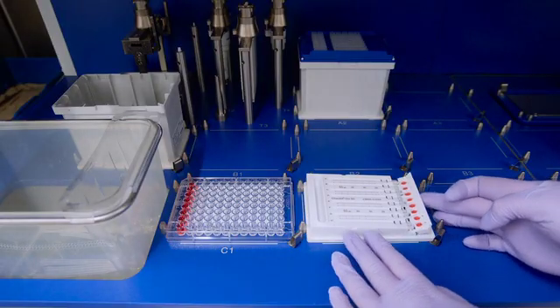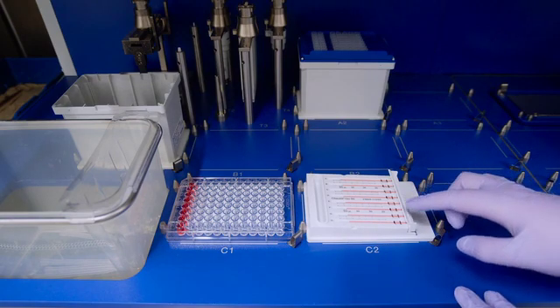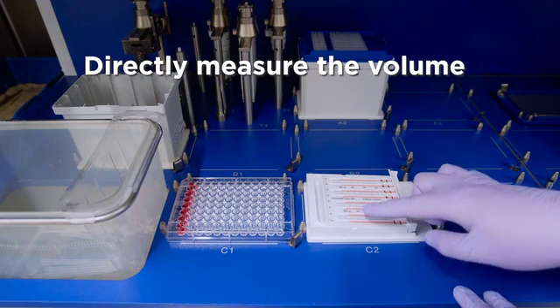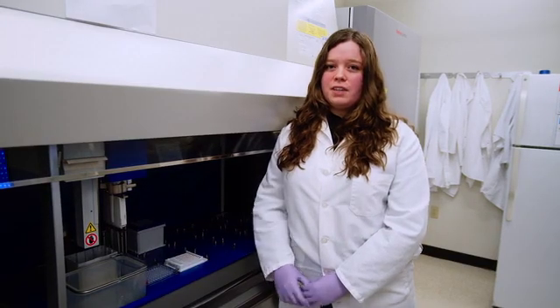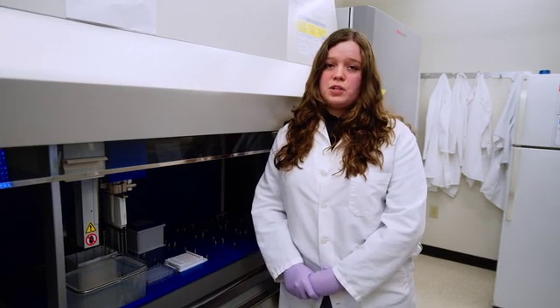The speed and force that we recommend flipping the tab is about the same as you would do with a light switch. You will see that the dye flowed right to the 50 microliter mark, which was the amount that we had our robot dispense, meaning that our robot is in calibration. When reading your Checkit Go, it's important that we leave the cartridge flat on the surface, as picking it up can cause the dye to move and will skew your results.